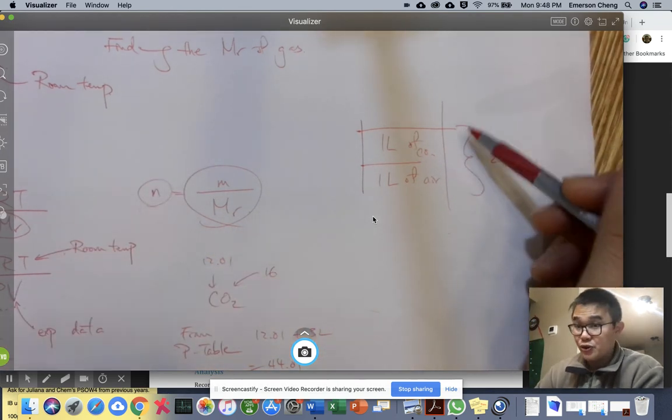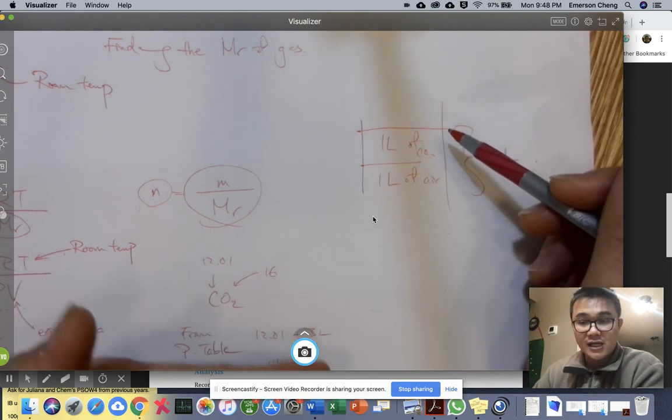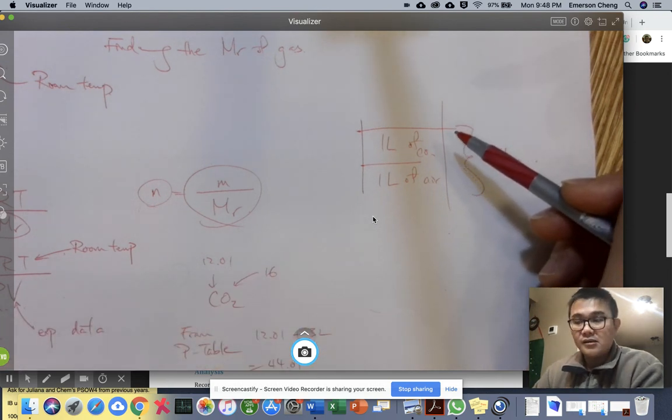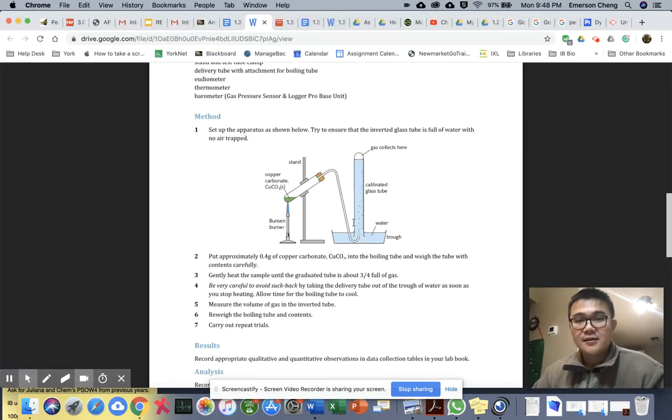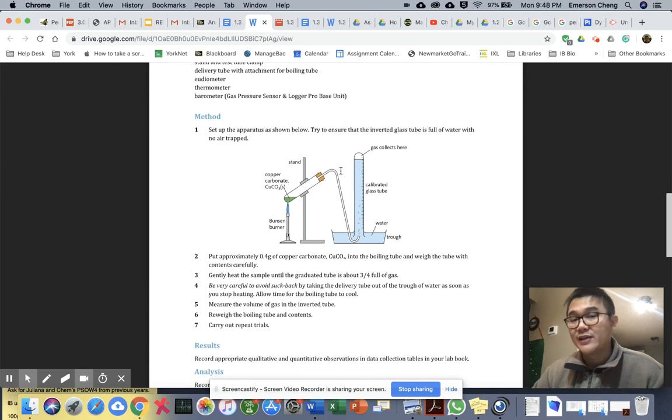We're assuming that's not happening here, but we're not sure. Based on how we did this experiment, where we're not producing gas, pushing CO2 to a bubble and then putting it in, you can potentially reduce that.